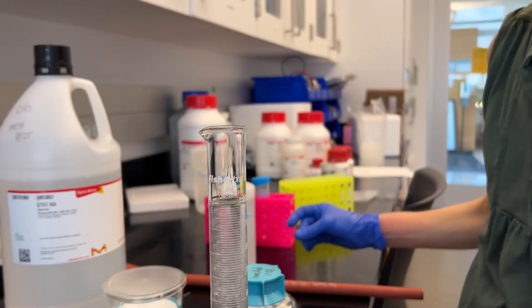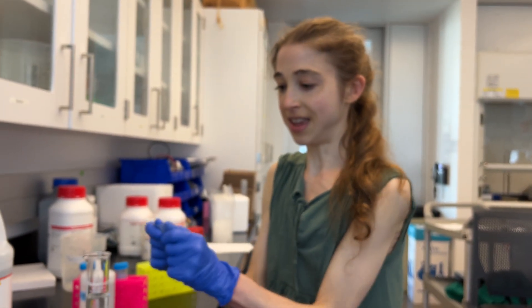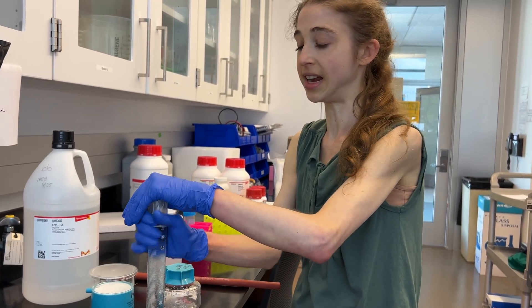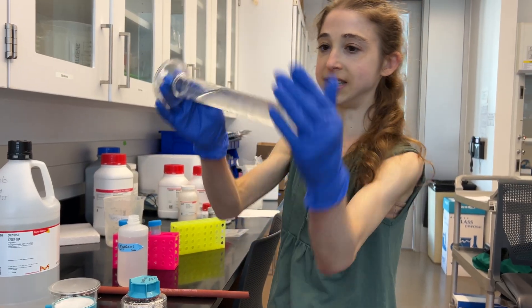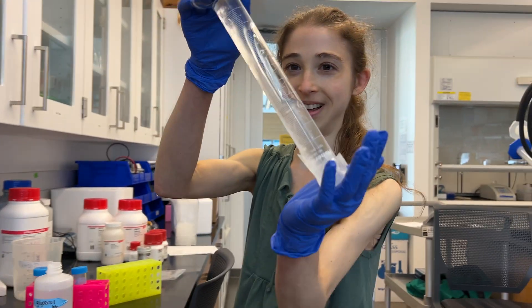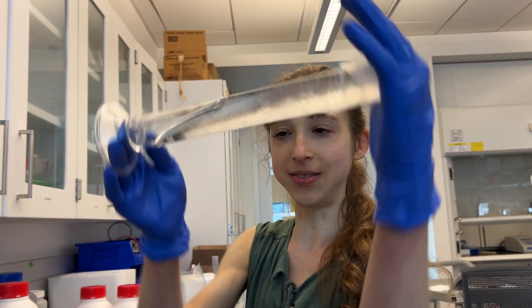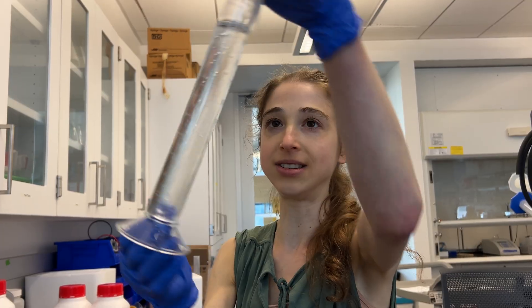Now comes the best part. Take your parafilm over the top — this is one of the best ways to mix anything. Just parafilm over the top and mix it up. You can see it's mixing really well and starting to become viscous. You want to do this quickly before the glycerol settles.